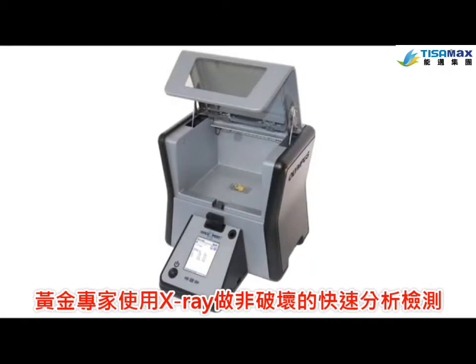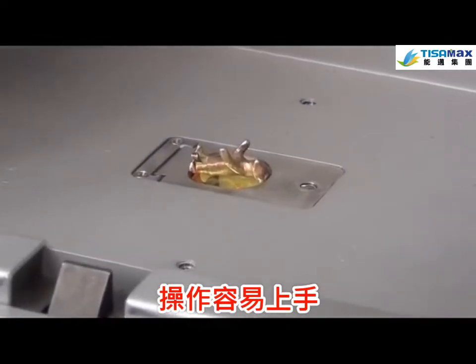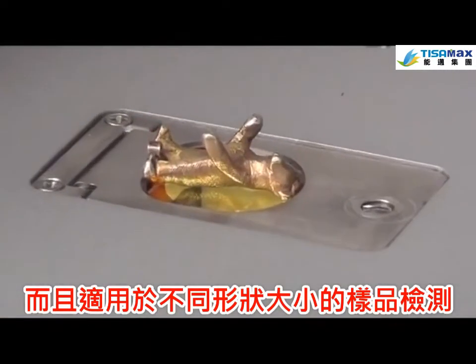The Gold Expert uses X-ray fluorescence, a non-destructive and fast analytical method to test samples. It's easy to use and adapts to nearly any sample size or shape.